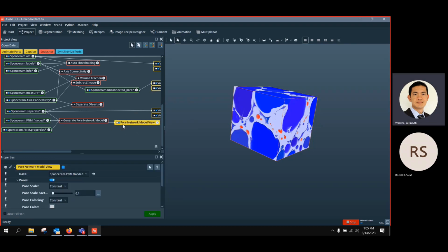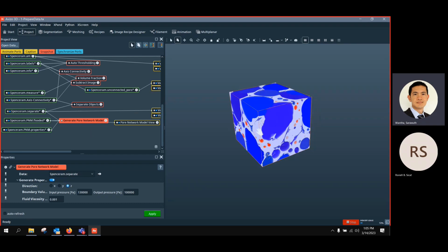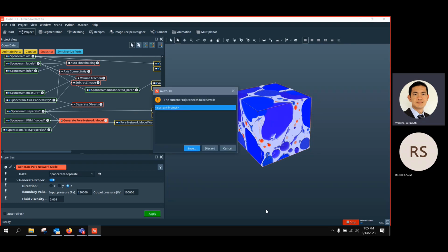Thinking maybe it was not 72, but maybe it was 0.72. Yeah, less than 1%, exactly. That's 70%. Yeah, I was wrong on the interpretation because this one is 8%, previous is 0.7. Just very minimal, very small. Yeah. Okay. That's the pore network model.